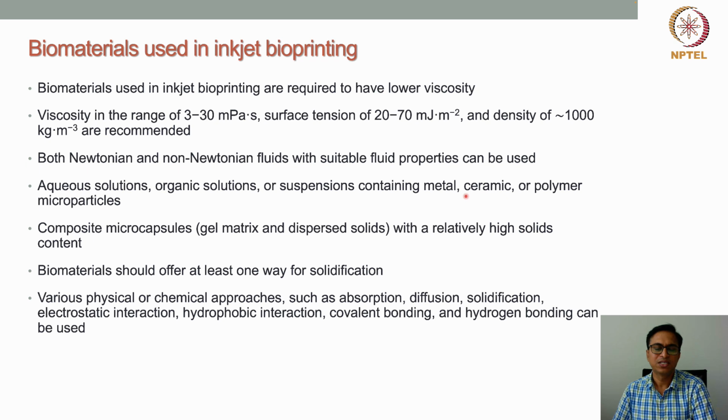Suspensions containing metals, ceramic or polymer microparticles, when these microparticles are suspended in a particular medium, can also be used as a biomaterial for inkjet 3D printing.